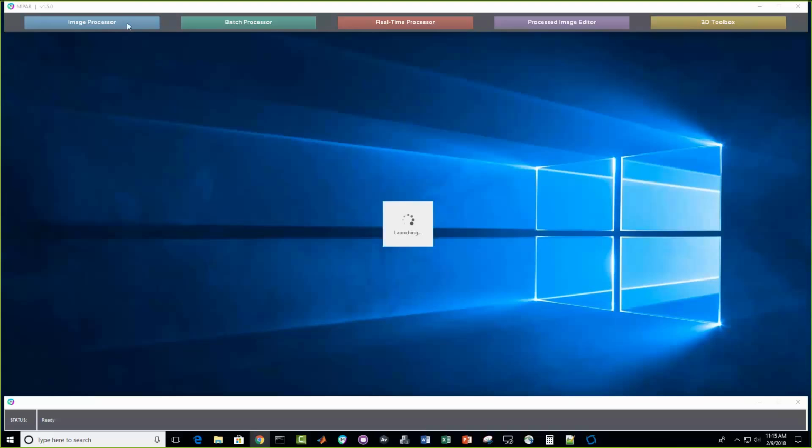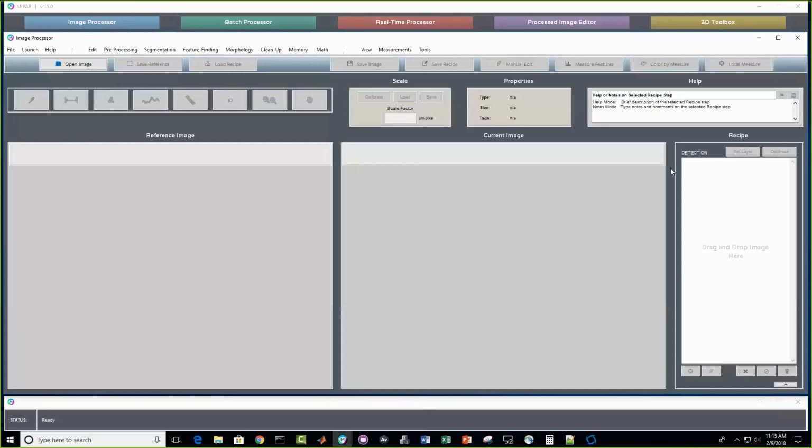I have 2 conference papers due to MIPAR, 1 journal paper before Christmas, and another journal paper that we are using MIPAR again, and we are showing our metrology platform for cell shapes. And yeah, that's what I'm really.